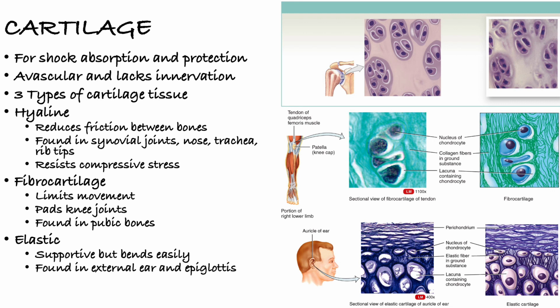So one of the things you're going to see about cartilage is that it looks like googly eyes. I hope everyone sees that, all right? It looks like googly eyes. I especially like hyaline cartilage because I feel like this is the quintessential googly eyes, all right? So it looks like googly eyes. So do not confuse this with adipose tissue. A lot of students tend to do this. Do not confuse cartilage with adipose tissue at all.